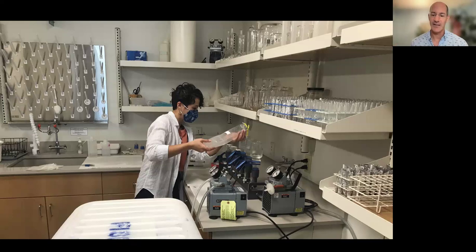The DNA is captured on the filter and then the water passes through. So you go from having a sample of water, in this case, to having all of your DNA collected on a little filter. And then the part that I'm not going to talk in super detail about today is the part where the magic happens. You take that piece of filter paper that has DNA on it, run some chemicals through it that extract the DNA, that pull the DNA off of it. And then there's a couple different approaches that I'll talk about for how you identify or work with that DNA to identify what might have been in your sample.